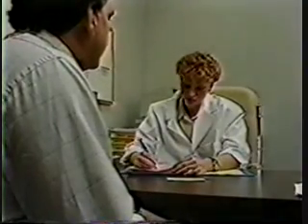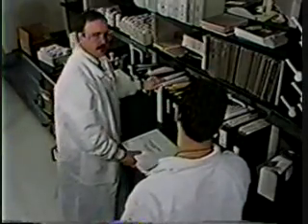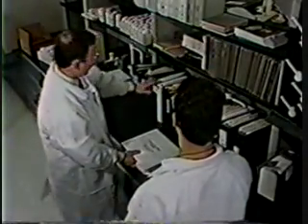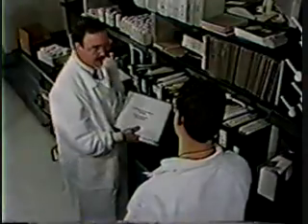Your lab's chemical hygiene officer, safety director, and your area supervisor are also important sources of information. If you have a question, just ask. Here are all our safety procedures. Once we've used these resources to identify the hazards a chemical presents, we need to take steps to protect ourselves.